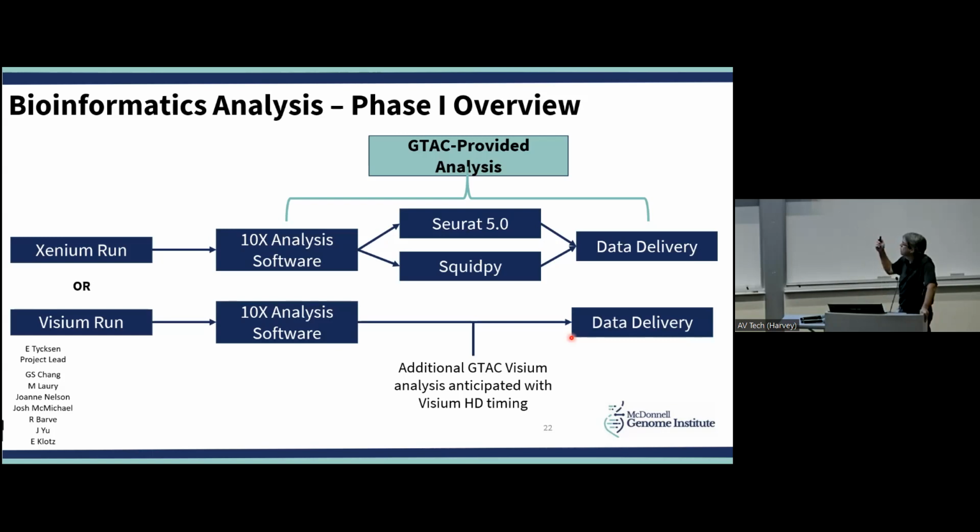Visium will be next on our roadmap, and we'll probably release workflows, we'll see. We'll see if we're able to get to that because there's a lot more we're going to do. As I'll show you, there's more we're going to do with the Xenium platform in terms of the software. This is just to get things started. And we have quite a bit more that we're going to be adding into the system. But we will probably try to align a release for Visium analysis around the time of the HD, which, as we mentioned, may only be about 6 months out.